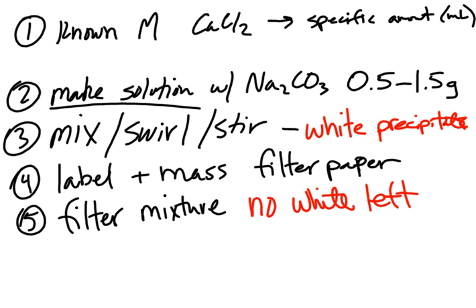Okay, and then six, you let it drip down. You're going to want to kind of know what you're doing in here, because the filtering can take a while, especially if you use a lot of water. So don't overdo it with the water, because the more water you use, the longer it's going to take to filter, which means you're going to be sitting there doing nothing, waiting for it to filter.